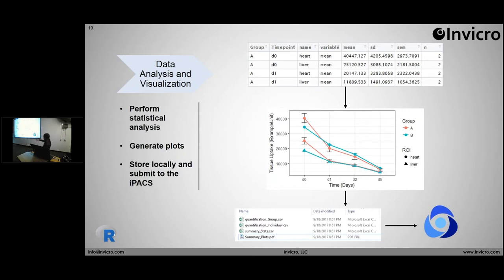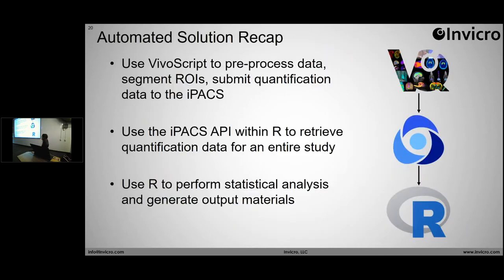Once you have all of these on a local source, another utility of the IPACS is you can submit those files back to the IPACS, so now you have them on a local source and in the project folder on the IPACS. To recap this lengthy workflow: I use VivoScript to preprocess data, segment ROIs, and submit them to the IPACS. I follow that up by using the API within R to retrieve that data, and then perform data manipulation, statistical analysis, and data visualization within R.